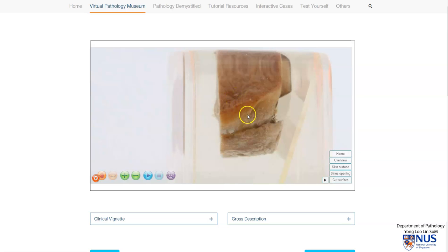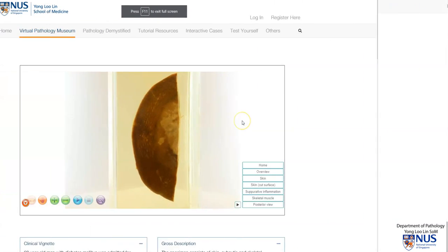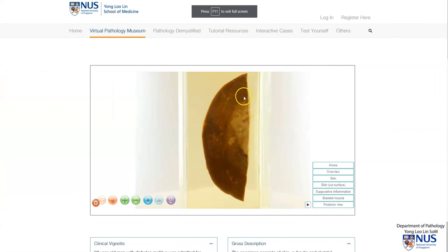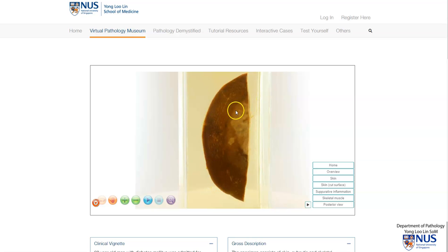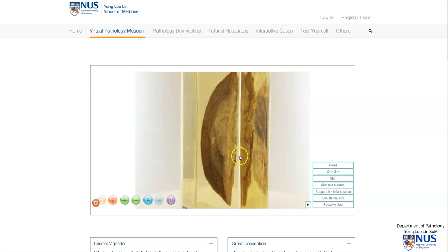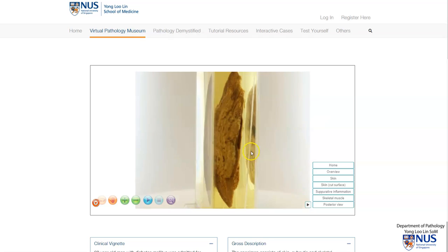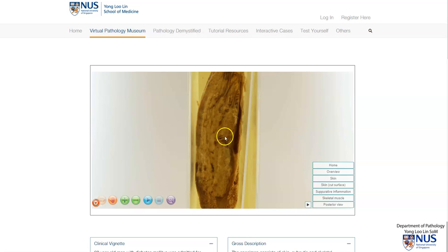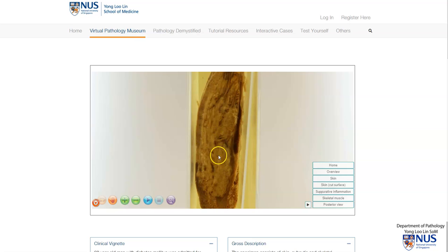Let's look at one last case. This final example again shows the skin surface and a discolored area of inflammation. On the cut surface, this leads to a deep area of suppurative inflammation that extends through the dermis quite deep into the subcutaneous fat.